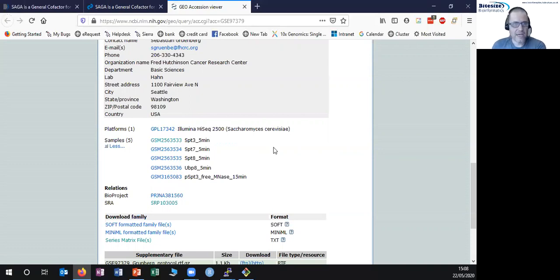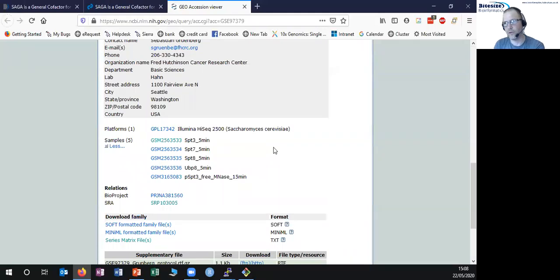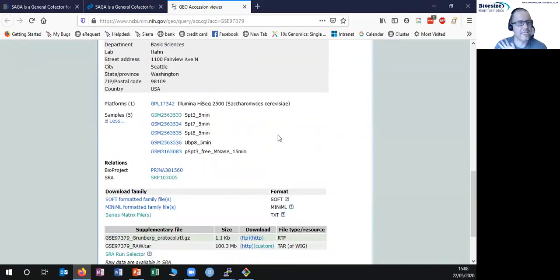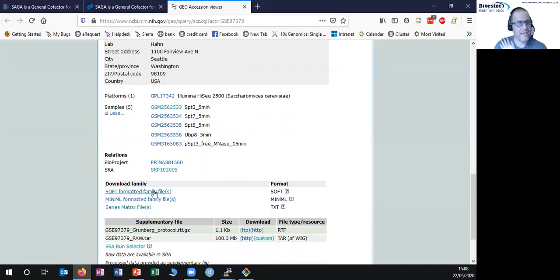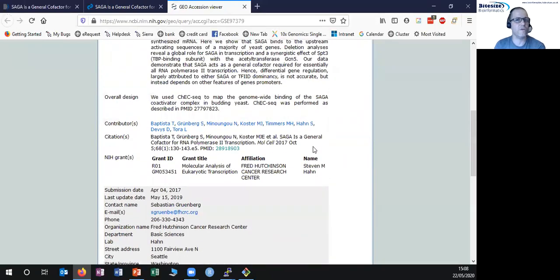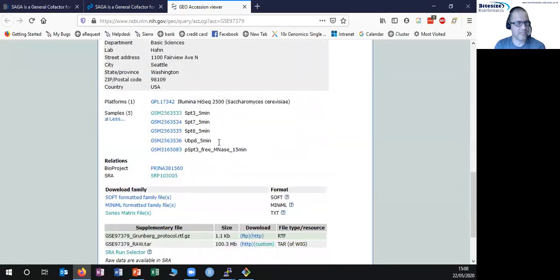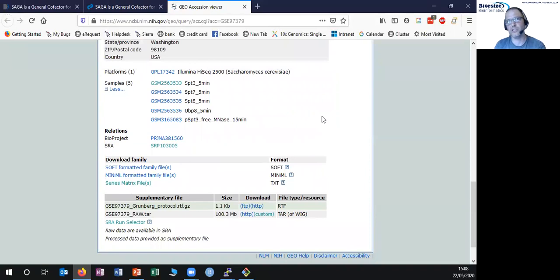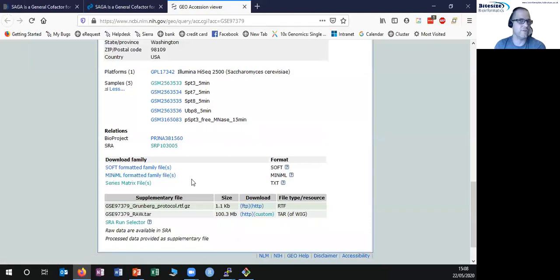From a GEO accession, there are three different types of data you can potentially get out. Two of those are directly downloadable from this page and one isn't — and unfortunately the one that isn't is most often what we want. The first type is down here where it says 'download family.' What we have in here are different reformatted versions of the metadata for this study — the sort of stuff we saw up here plus the details for the samples, including experimental conditions and annotation. There are a few different formats you can download this in, but there's no actual experimental data there — just the descriptive metadata for the study.